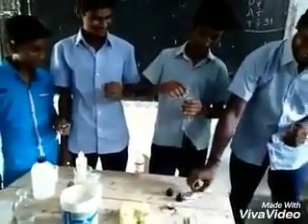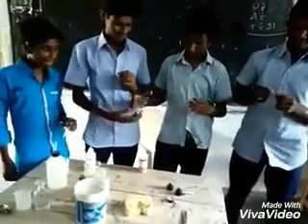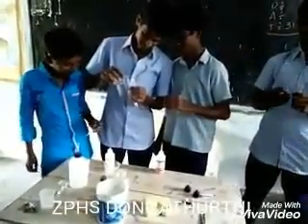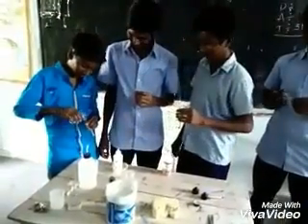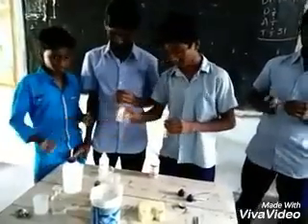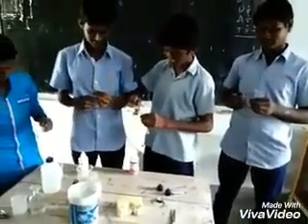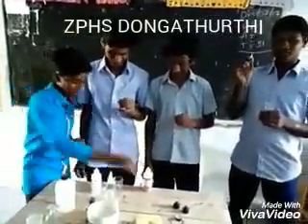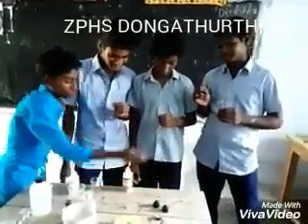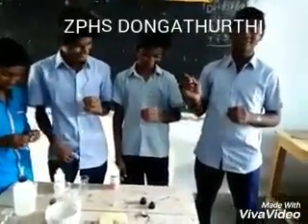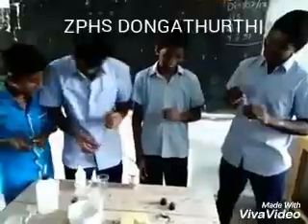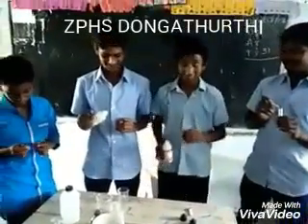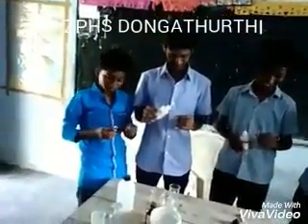Four students take potassium hydroxide and pour it into four test tubes. The first student takes red litmus paper, the second student takes phenolphthalein indicator, the third student takes methyl orange indicator, and the fourth student takes blue litmus paper.